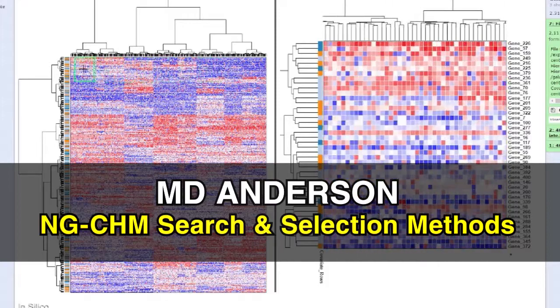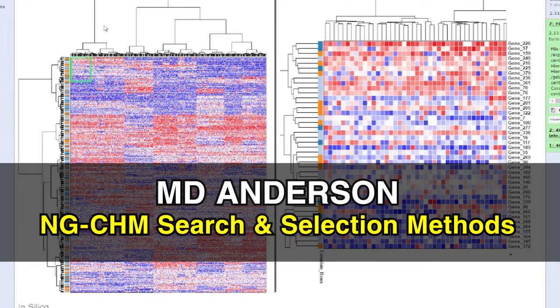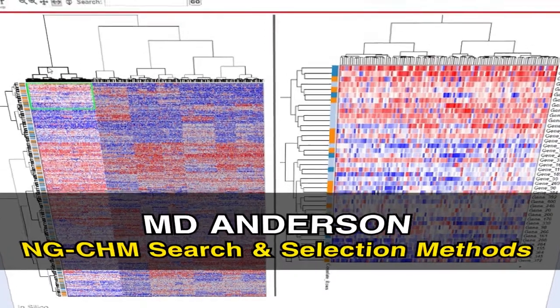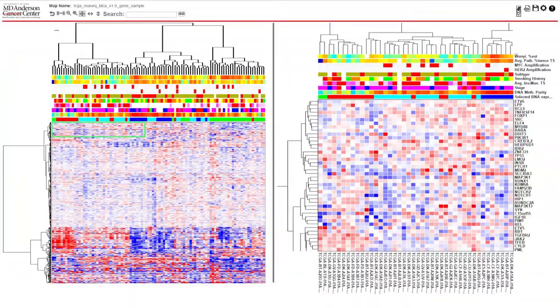In this video, we will go over the search and selection options for MD Anderson's Next Generation Clustered Heatmap. Once you've opened your heatmap, you will find the search bar at the top on the right side of the tools menu.